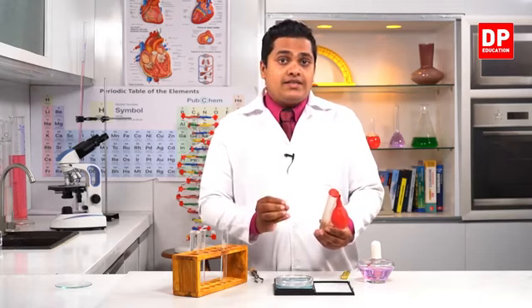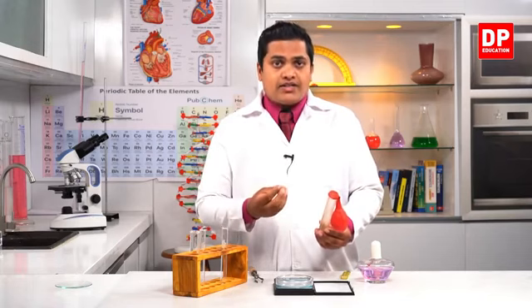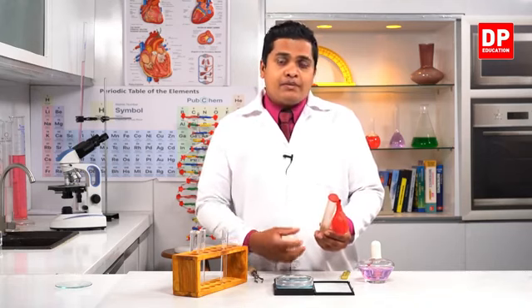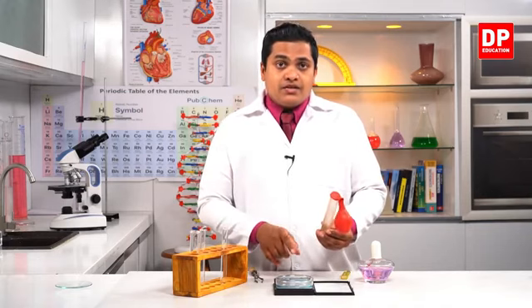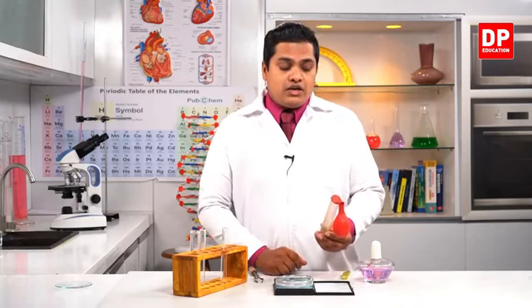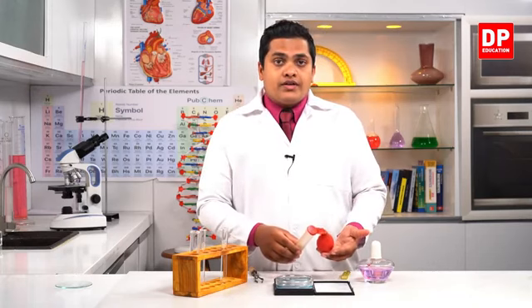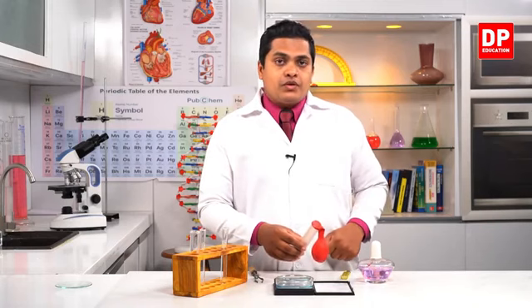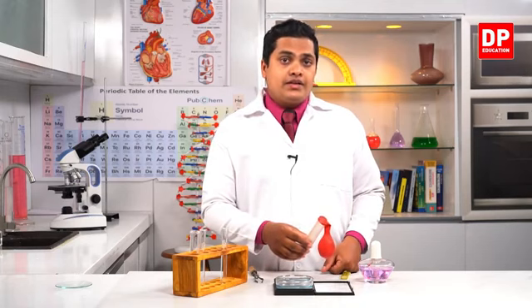You know that gases or smoke are a type of material. It's a type of matter. Almost all matter, 100% of matter in our environment, has a mass. This digital balance is very sensitive, so we can even measure the masses of gases as well. So when the system is opened, the smoke which is coming out has a mass. So that's why the reduction of mass occurred in the earlier case.